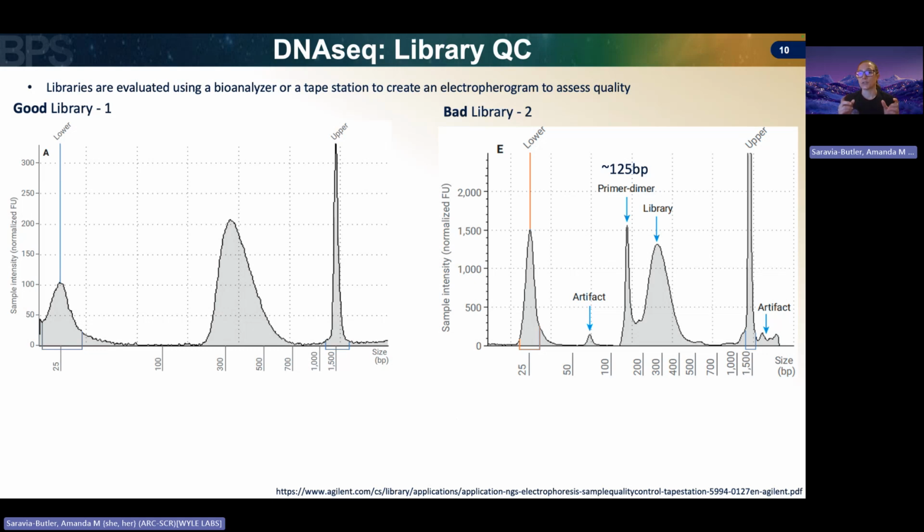Why it's so critical to remove these is because if you don't, either side of that primer will just attach to itself and not have any of your unknown sequence in it. So it would just be the 3' adapter and the 5' adapter attached to each other. And this is going to be a huge issue when we go to sequence our libraries, as we'll see in a minute. So it's very important that we do not see any primer dimers when we do our quality check on our libraries for each sample.